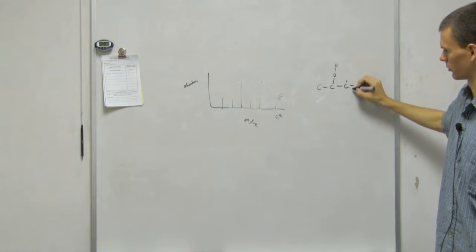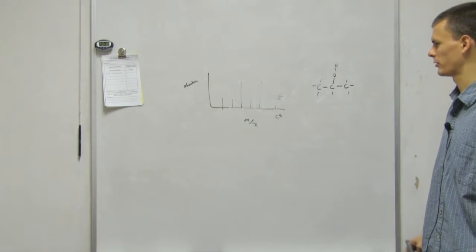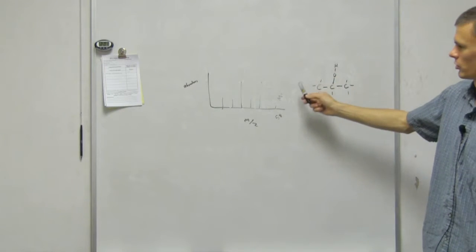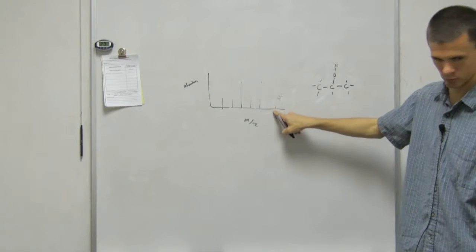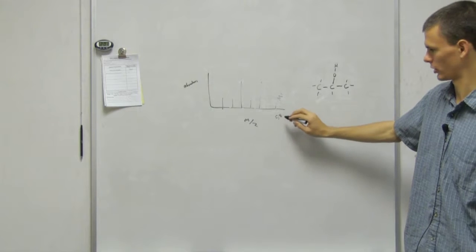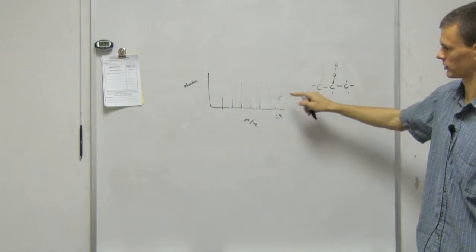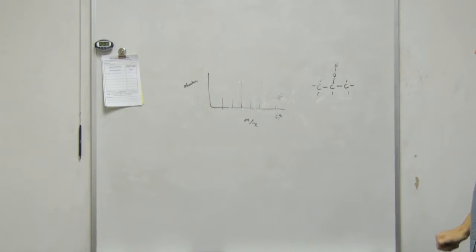So here's your molecule. They say they don't know what it is. You put your molecule into this machine and it tells you how much it weighs, so you can determine the molar mass of this molecule. And then it also tells you the fragments that most likely form.